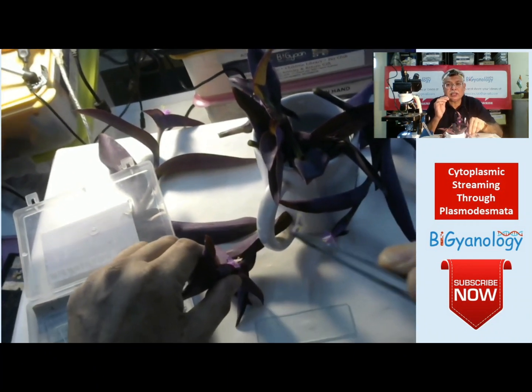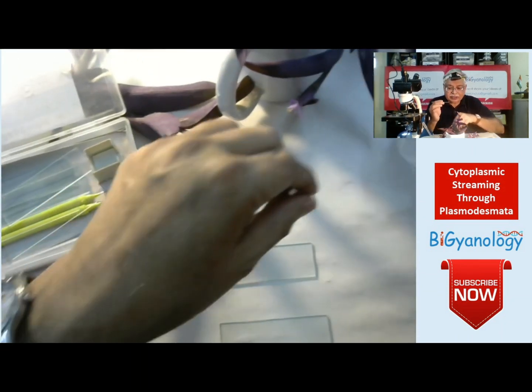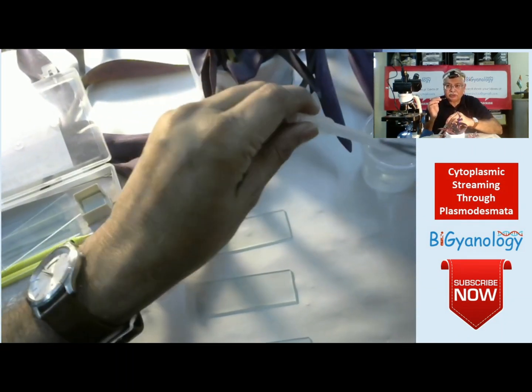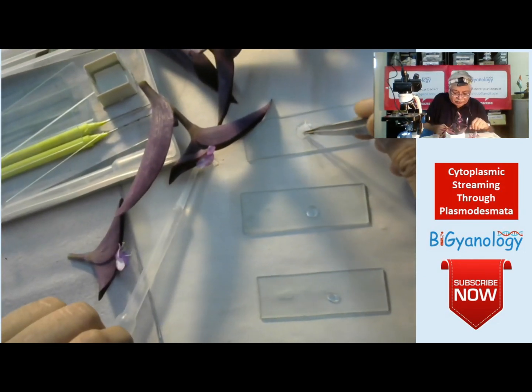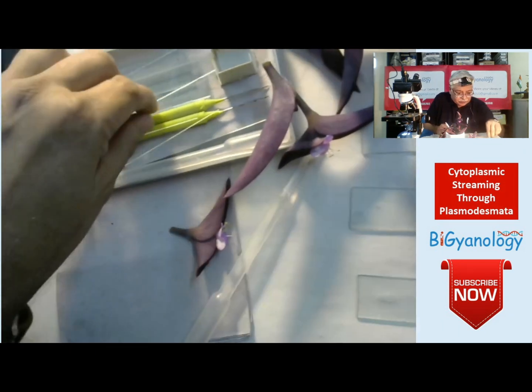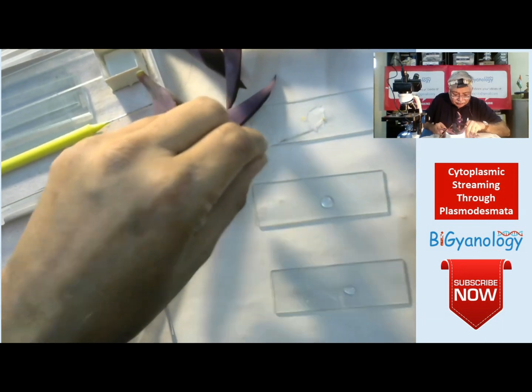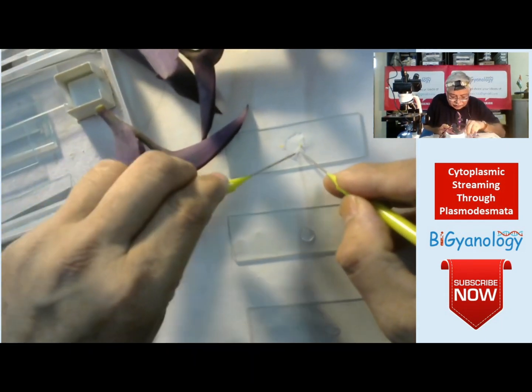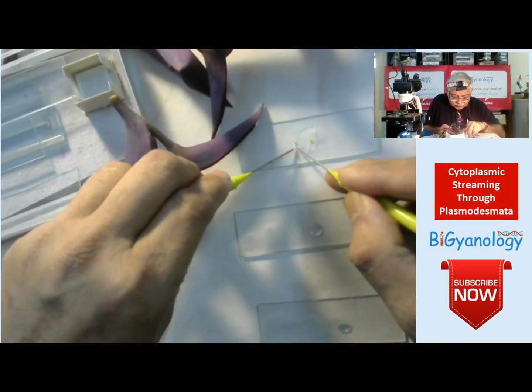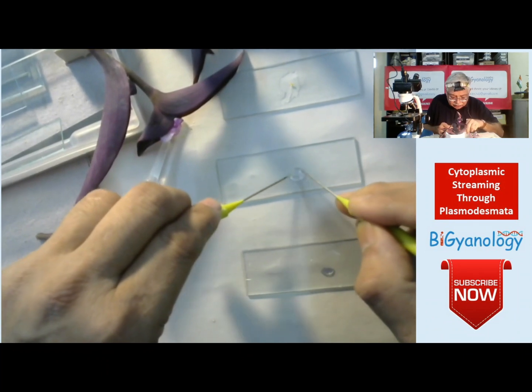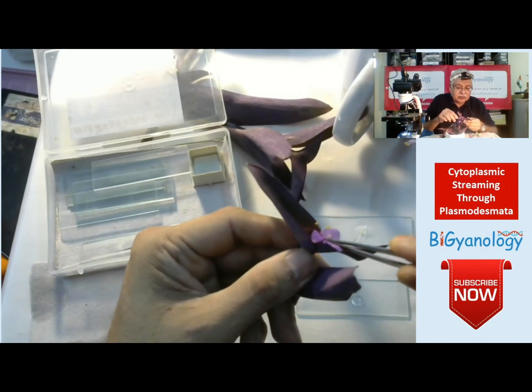This hair can be seen by the naked eye, but when we see through the microscope we see a lot more. Here we are giving a drop of water. I am placing this stamen on each slide — one stamen with the hair, and I am taking another stamen to a second slide, and a third stamen to a third slide.